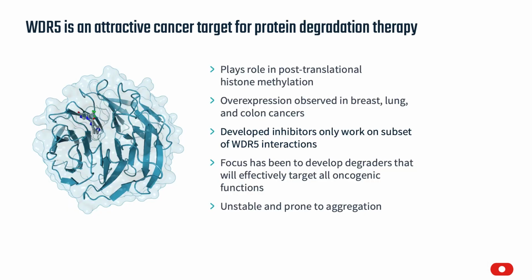Our target of interest, WDR5, is a protein that plays a critical role in the process of histone methylation, which is important for the regulation of gene expression. Dysregulation of WDR5 expression and function has been implicated in the development of cancers, particularly through its interaction with the MYC oncogene.